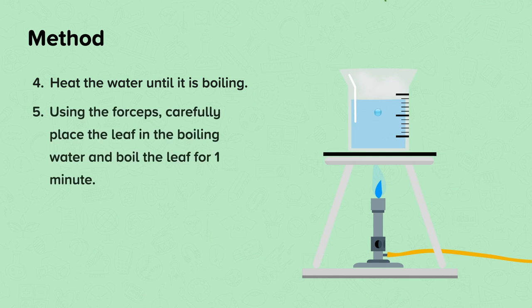Step five, using the forceps carefully place the leaf in the boiling water and boil the leaf for one minute. This step is important because the boiling water kills the leaf, removes the waxy cuticle and disrupts the cell membranes and cell walls. This makes it possible to extract the chlorophyll with ethanol and allows the iodine to penetrate the cells.